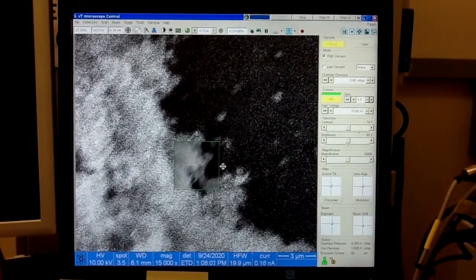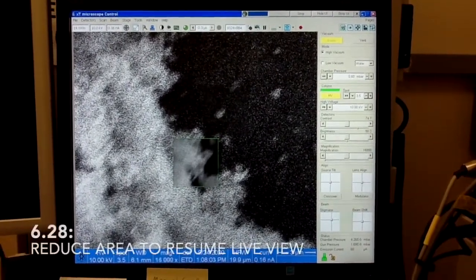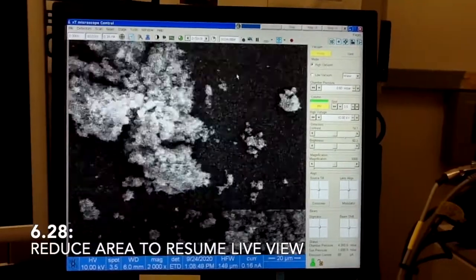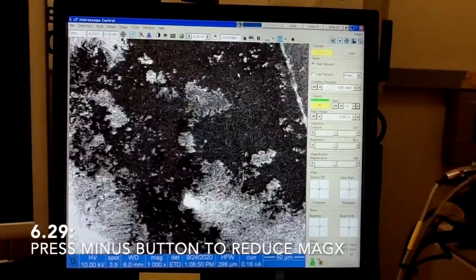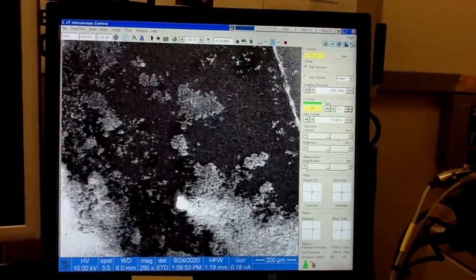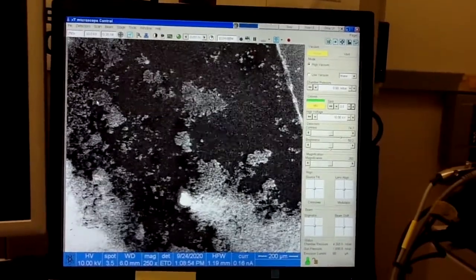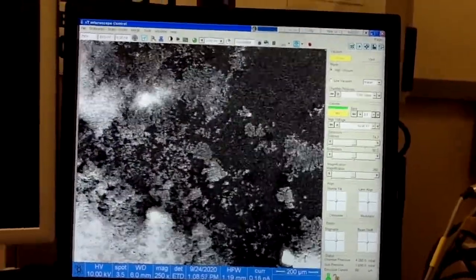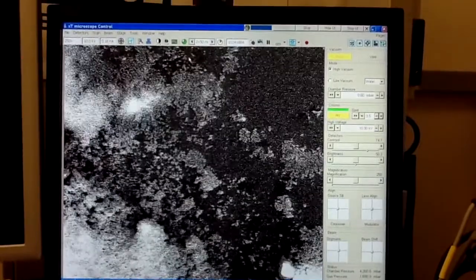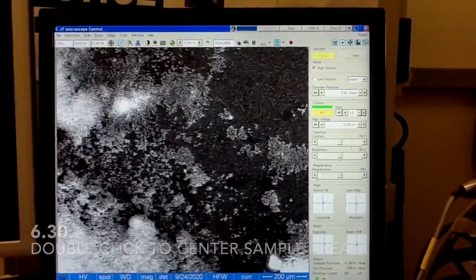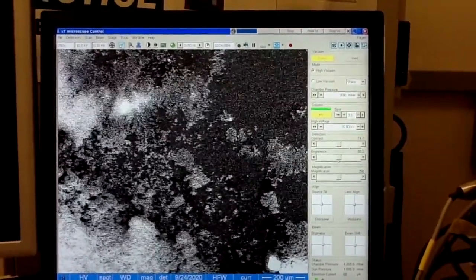When you switch back and forth between these two modes you may notice that the astigmatism shows up, so then you just make sure that you remove it. That's most of the things you need to know. Of course, you can look at different areas of your sample wherever you click. Like if I click in this area, this area will be brought automatically to the center of the image.